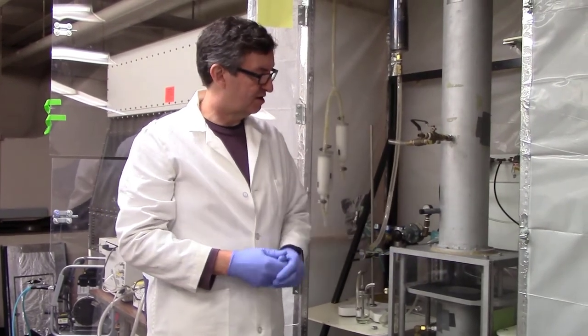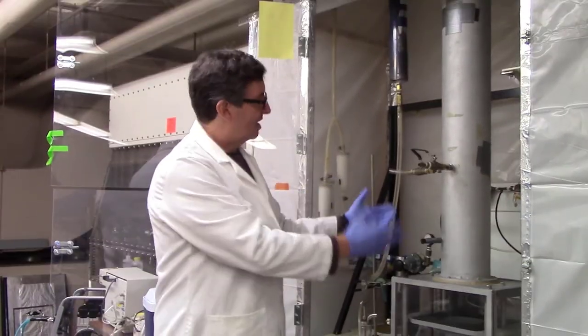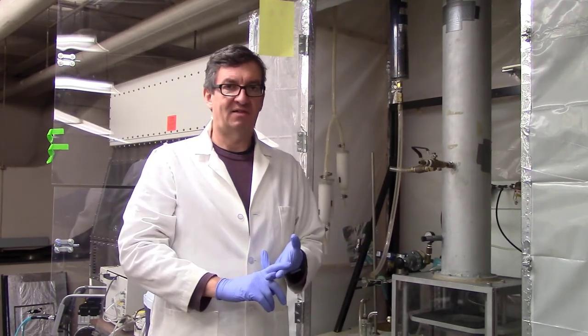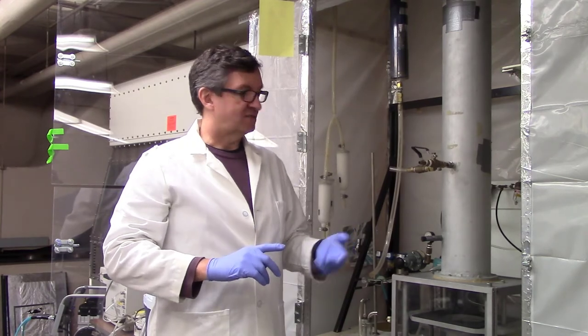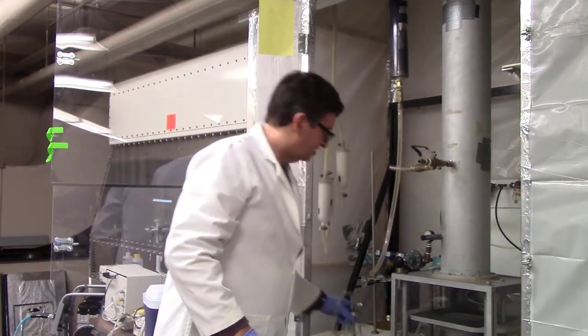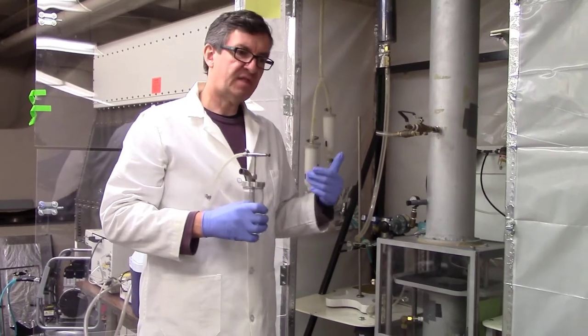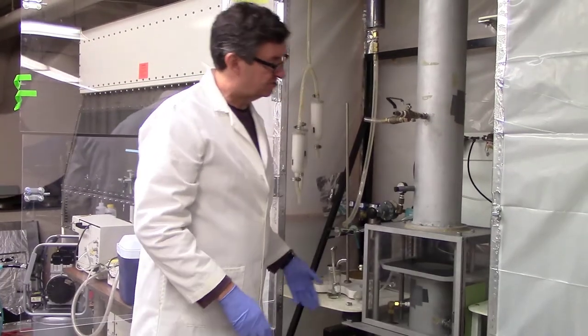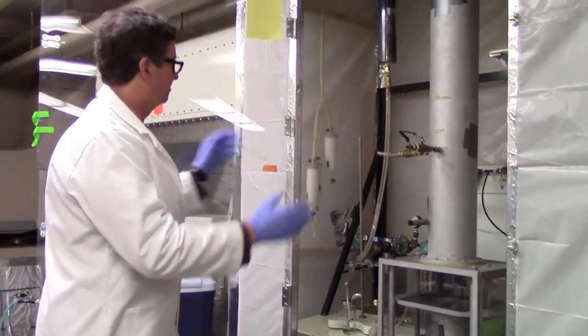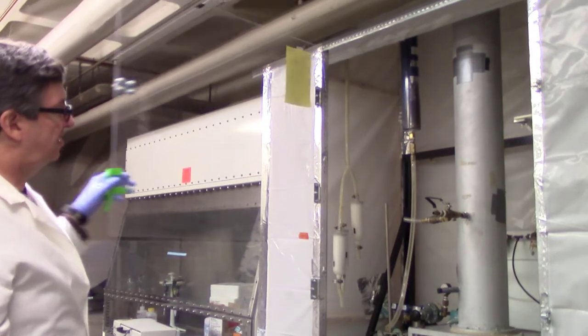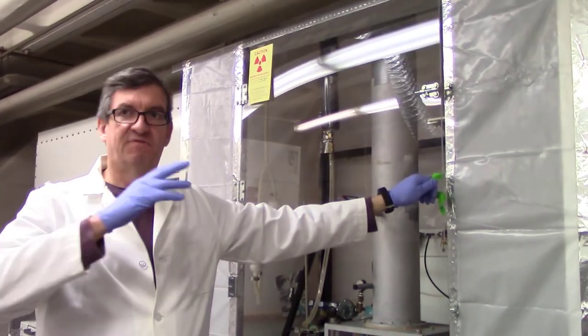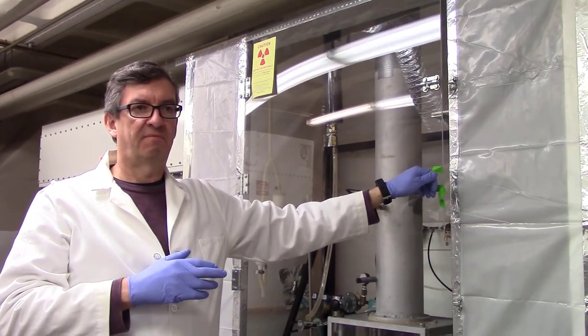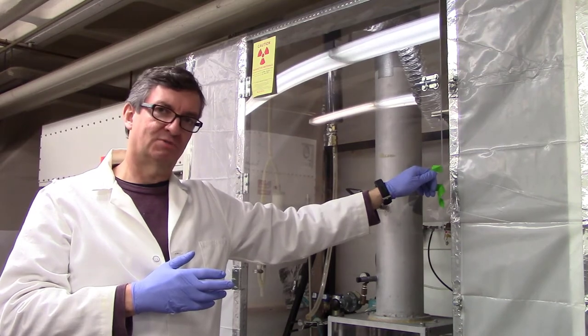In this apparatus we've tested liquid aerosols, we've tested microbiological aerosols, we've tested nanomaterials generated with something different than this apparatus, an electrospray aerosol generator. But they all can potentially create hazards, and so we have secondary containment around our apparatus. We can close this all up and it's ventilated, and so we can make sure that we're doubly protected from exposures to these aerosols while we're conducting experiments.